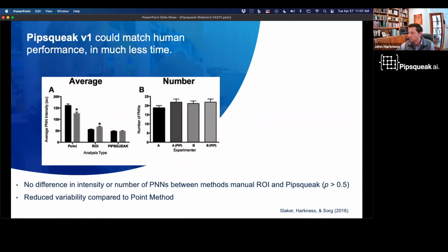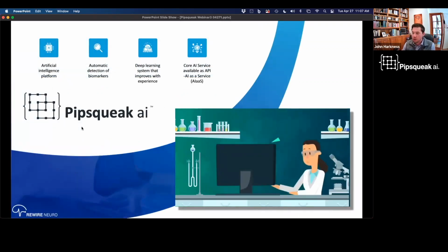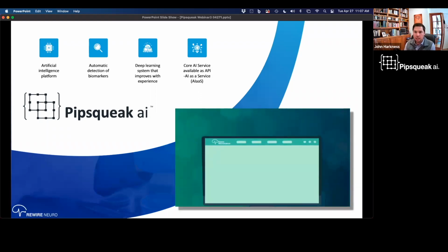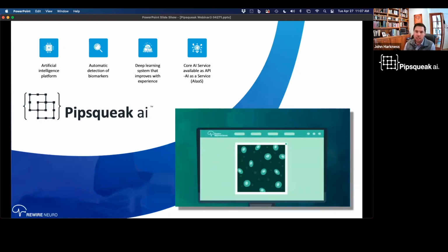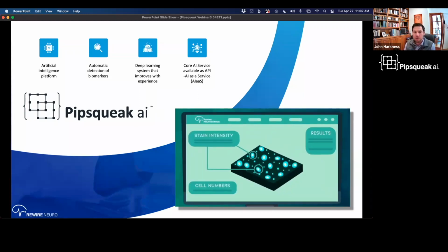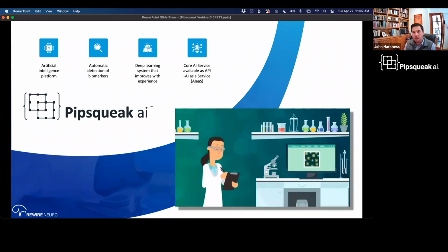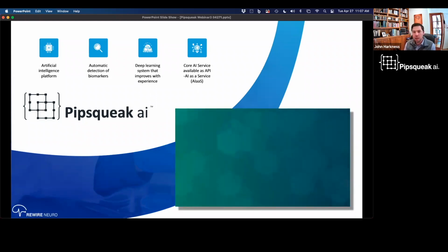That's what we published in 2016. Since then, we've continued to build on this and evolve it. Where we are today is really incorporating artificial intelligence to hit that last sticking point of detecting cells accurately. I'm sure you've all seen our little blurb on the website and this cute little video. But the meat of what we're doing is really trying to train computers to do that tedious cell detection for us. Downstream from that, Pipsqueak hasn't changed a whole lot.